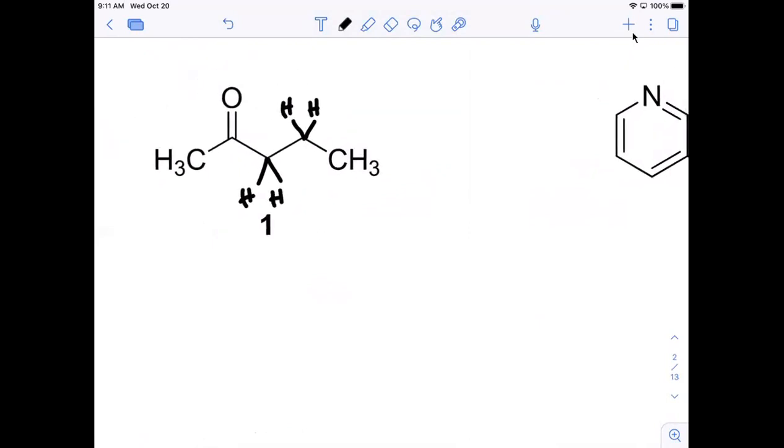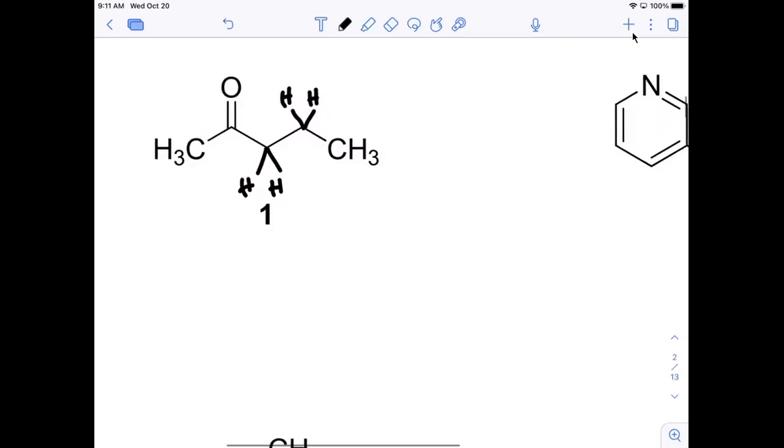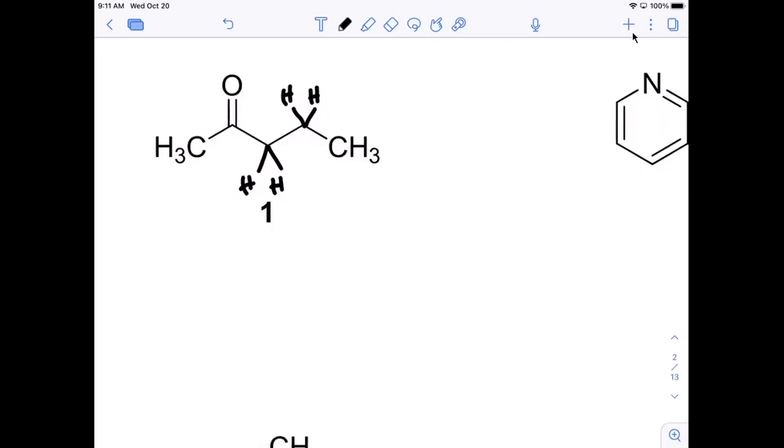Are any of those hydrogens equivalent? And what would you do in order to compare them? Aren't the two, like, split on the same, like V-shaped, equivalent? Because they're on the same carbon. Okay, that's good. Now let's see why or how we could tell them apart.